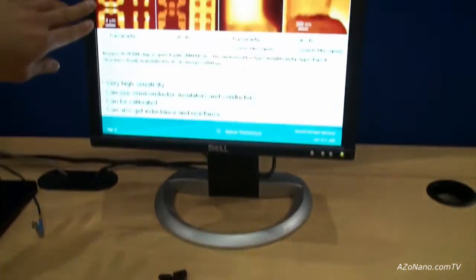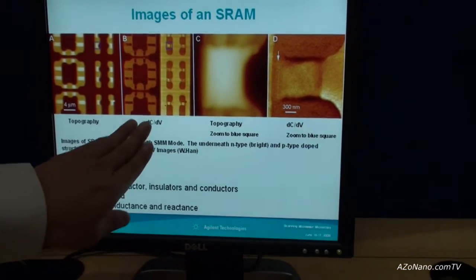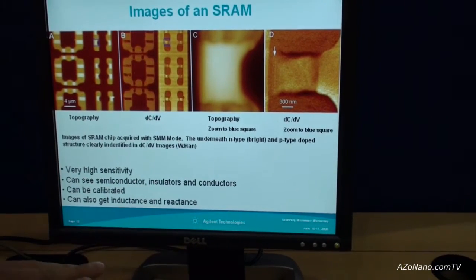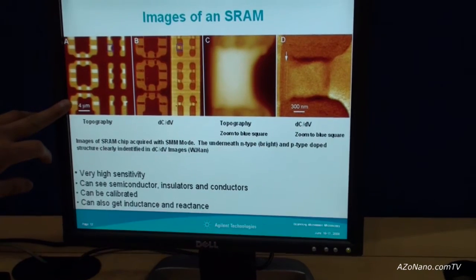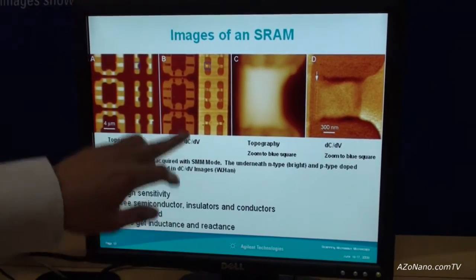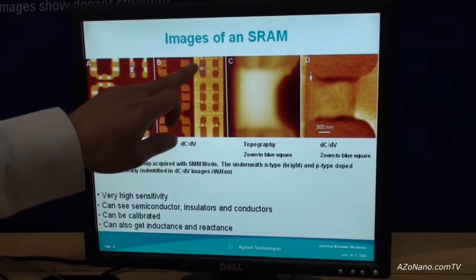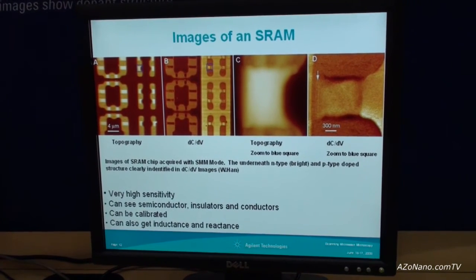For example, with a memory chip, you can see the P and N wells. This is topography, this is dCdV — the differential capacitance — and these are the two channels shown here. You can clearly see the memory structures and the dopant charge between the N and P wells. Zooming into one of these well structures, there is quite fine electrical resolution of about 10 to 20 nanometers.